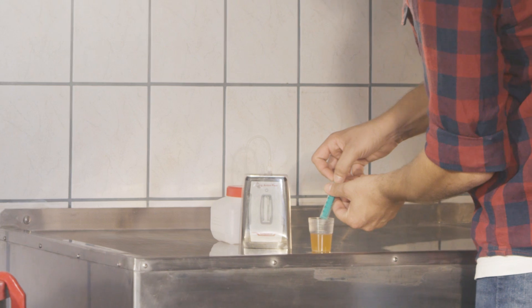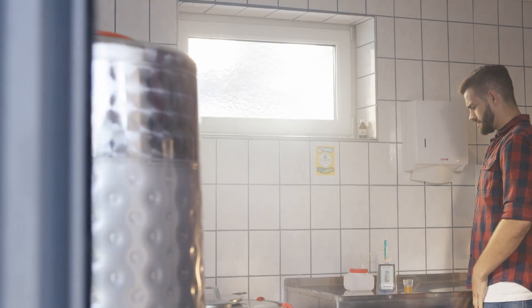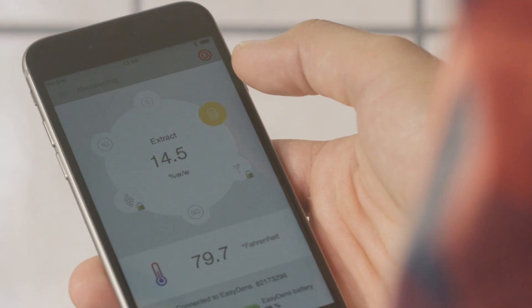With the help of EZDense, a handheld density and concentration meter developed by Anton Paar, you are now able to monitor the fermentation process of your beer with digital accuracy.